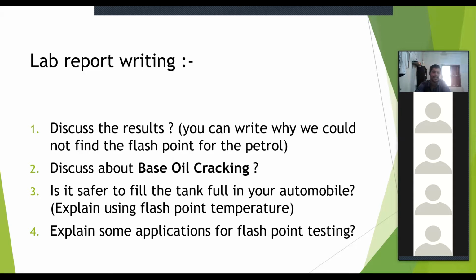So I have written some different questions for the discussion part mentioned in the lab sheet. I think you will refer to that lab sheet, right? The first discussion question is to discuss the results. It is about petrol fuel, but we haven't done it. Then you can discuss why we couldn't find the flash point for the petrol fuel in that environment. We can write why we couldn't find the flash point.